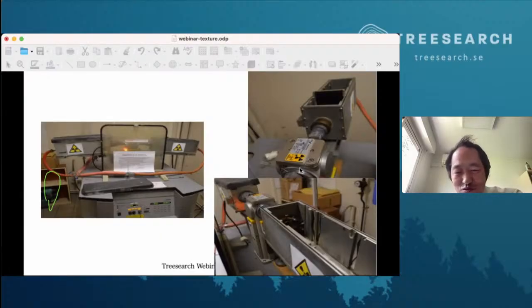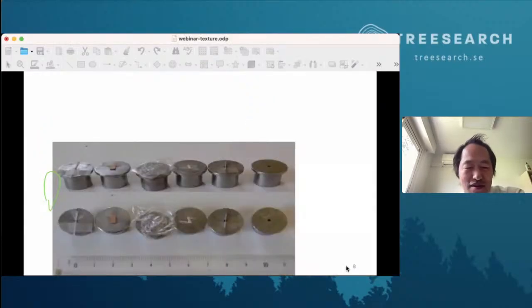It costs about 3,000 euros, but it's just a lamp, and we have one collimator here and one close to the generator. So it's exactly the same as the sketch, and we have slits where we can insert the film. We used to use film until 20 years ago, and this is how we put our sample. We can put any types of sample on. So you see a small hole, and behind we have another small hole with a lead pinhole. But you can put liquid or solid or of any shapes. You just put in the beam, and you can record.